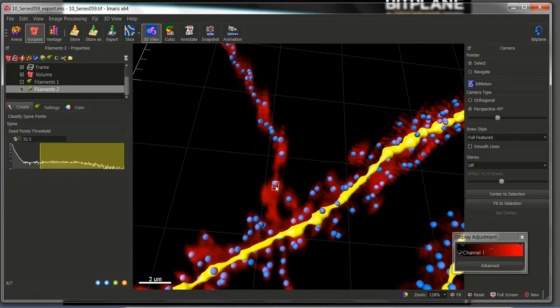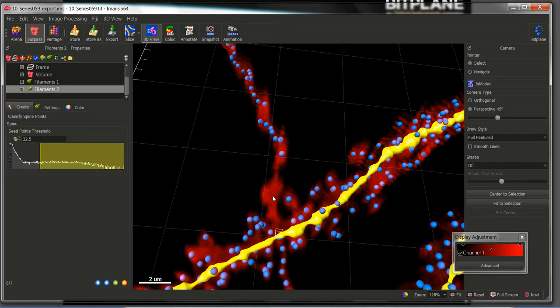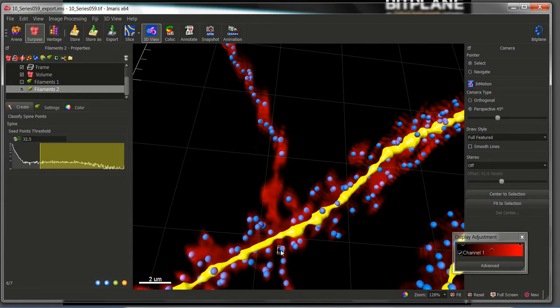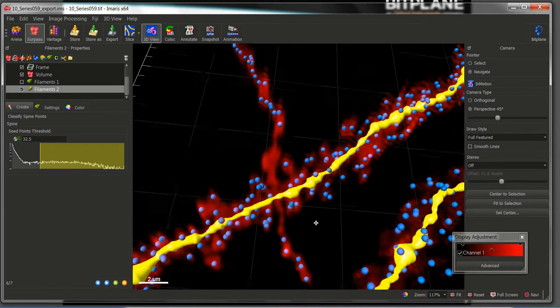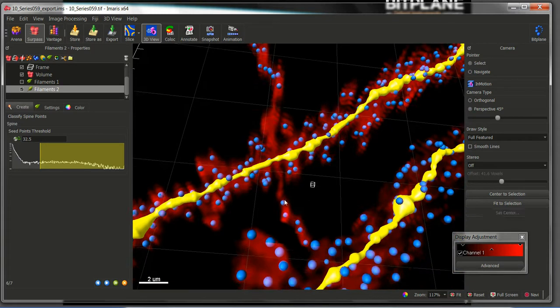Remember that we specified a maximum length of a spine of 2 microns. Therefore, as long as we don't have seeds within 2 microns, we will be in good terms in order to not detect a spine in this area. Something like this.